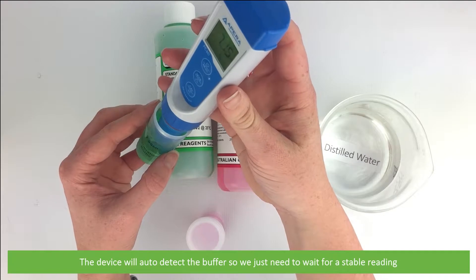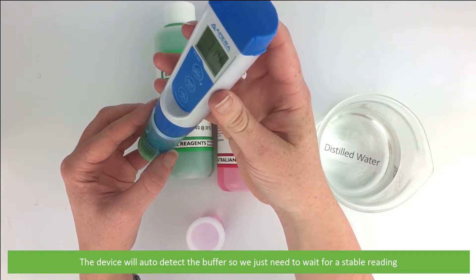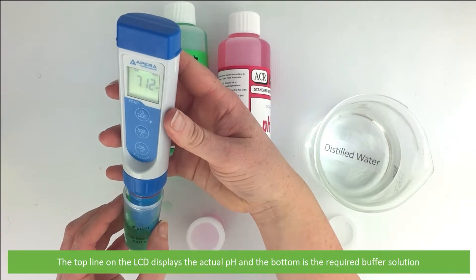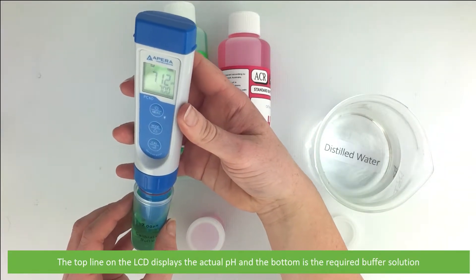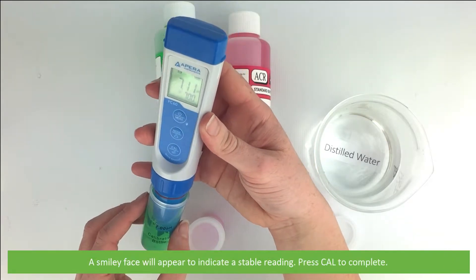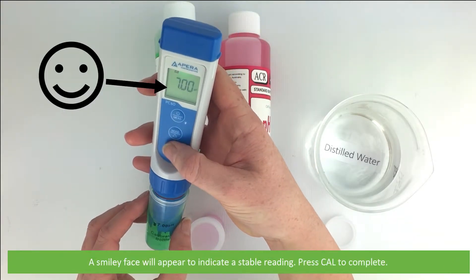The device will auto-detect the buffer so we just need to wait for a stable reading. The top line of the LCD displays the actual pH; the bottom is the required buffer solution. A smiley face will appear to indicate a stable reading. Press cal to complete.